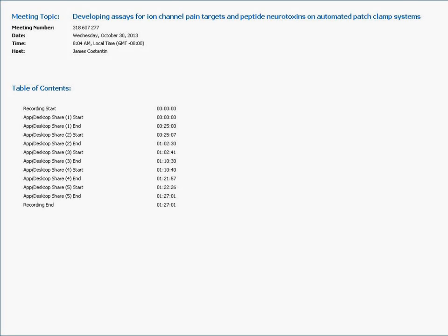So if you look at all this, the apparent IC50s of all these different compounds, we realize that these derivatives retain the inhibitory activity against Kv1.4. And these are supposed to be more stable than the 6BRMT, so it'll be a better tool to actually look at the inhibition of Kv1.4 and better understand its properties.